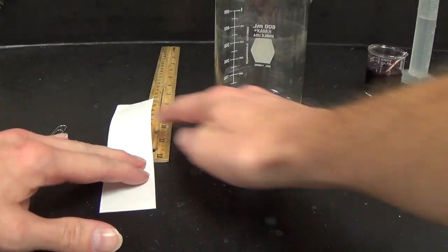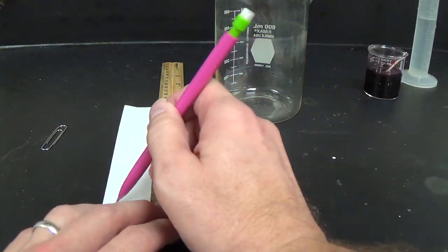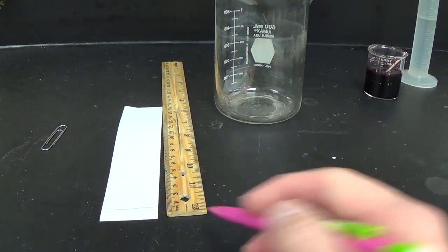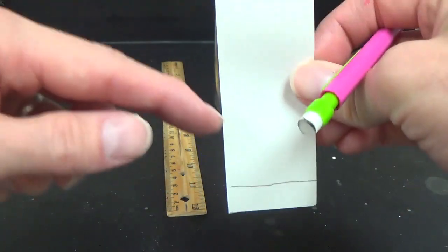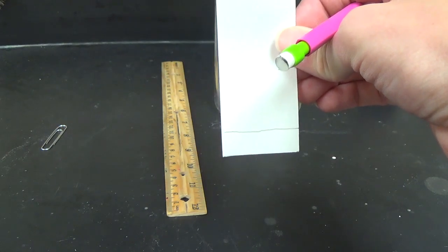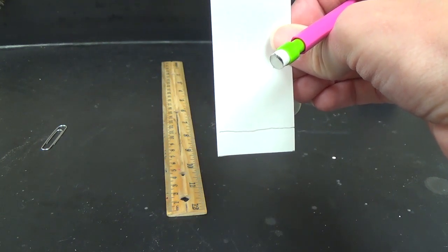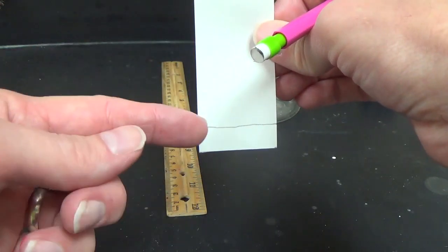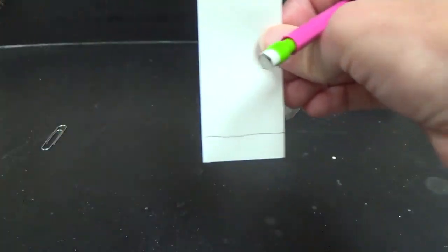doesn't really matter. But I'm going to start by making a starting line, and I want my starting line to be about 1 centimeter from the bottom, and check this out, I'm using pencil. Okay, and the reason I'm using pencil for my starting line, here you can kind of see it. The reason I'm using pencil for my starting line is I know that the pencil will not dissolve in my movable phase. That would be an issue. Then I would be separating what's in the pencil instead of, so don't use pen. If the pen were to separate, then you'd get pen interference with what you're trying to separate.